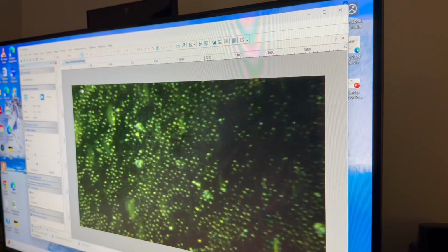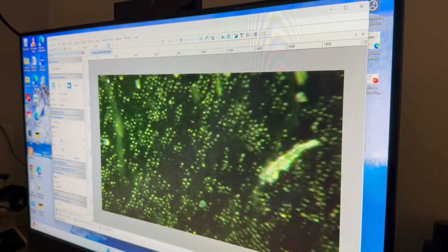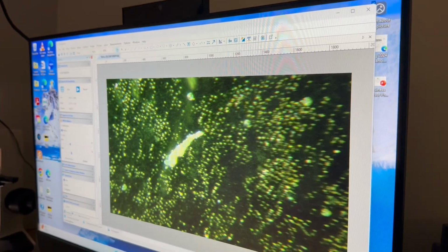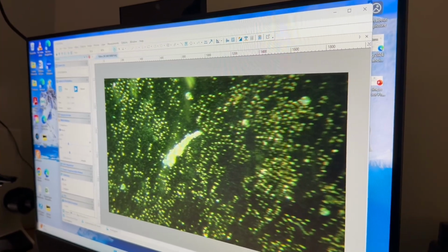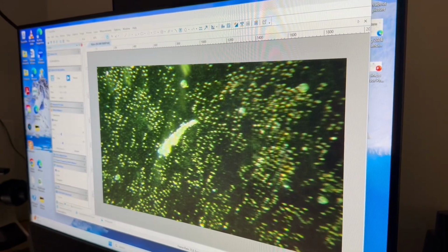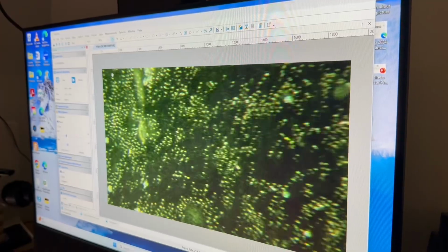And what I'm doing is just going up and down the slide, seeing if I see something that's abnormal, like that one there. This one here would be a little abnormal. Yeah, that's something. Normally we don't have lines like that. Normally things are round in the body, not straight. Is that on your chart? No, that one's not on my chart. What is it?